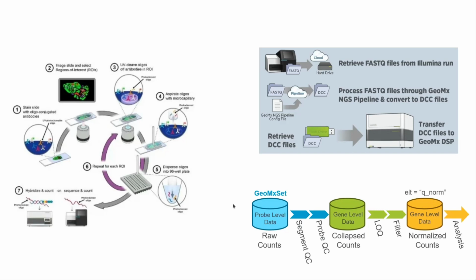For doing this, we are working with a workflow that is depicted down here, where we do all the things that we basically need to do in order to analyze the data. That includes some quality control things and filtering and normalization, and finally an analysis of the data.